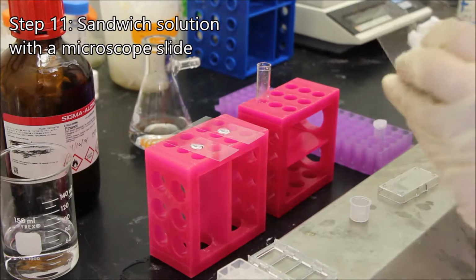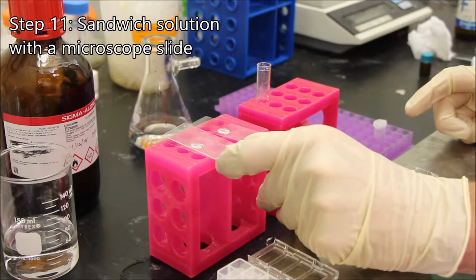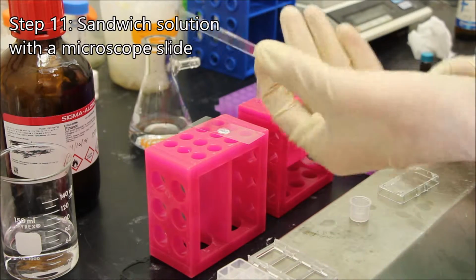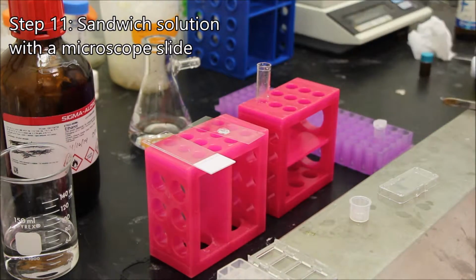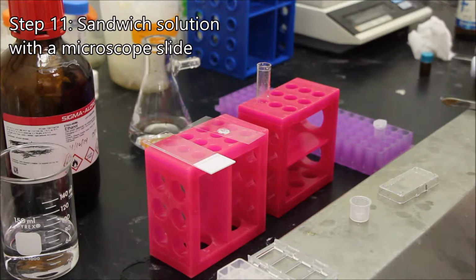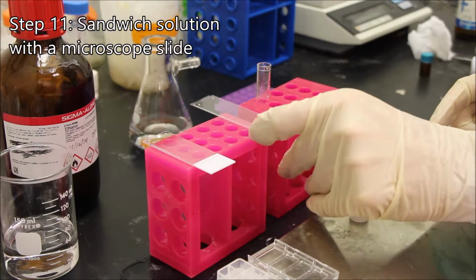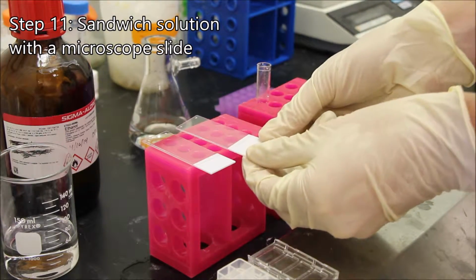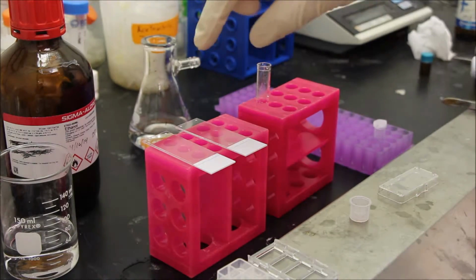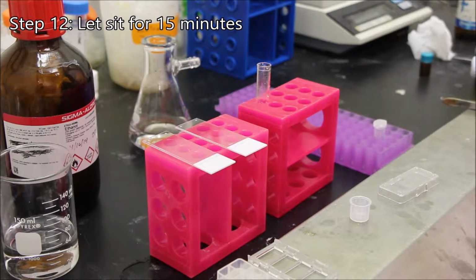Now I'm going to take the bottom microscope slide, turn it upside down, and carefully lower it until you see it just sucks up that gel. I'm going to do a second one. Sometimes you have to move it around a little bit to get it perfectly lined up. And now it's set. So now that gel is polymerizing between those two pieces of glass, and we're going to let it sit for 15 minutes.